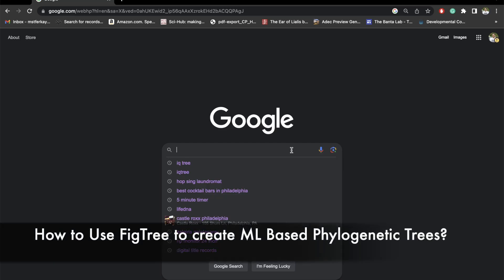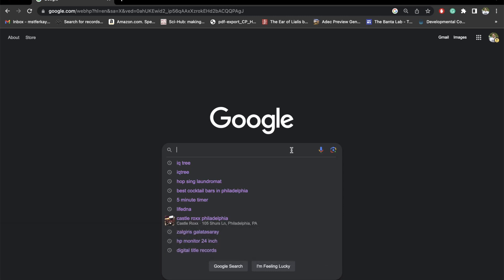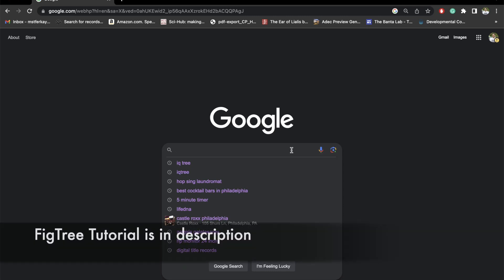Hi everyone. In this tutorial I will show you how to use IQtree to create maximum likelihood based phylogenetic trees, then how to use FigTree to visualize those trees.